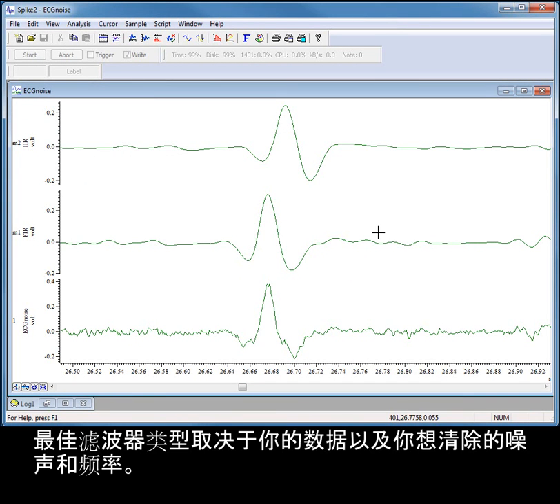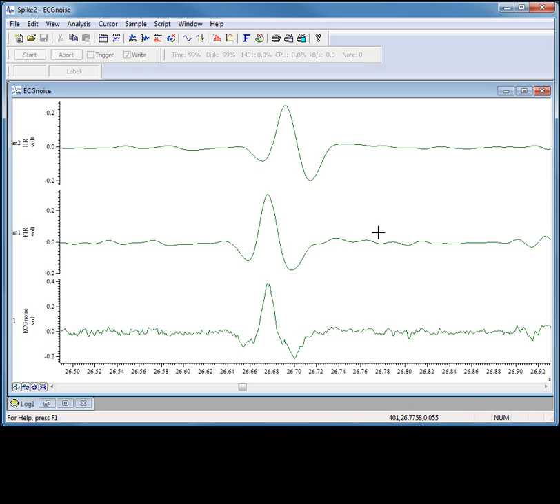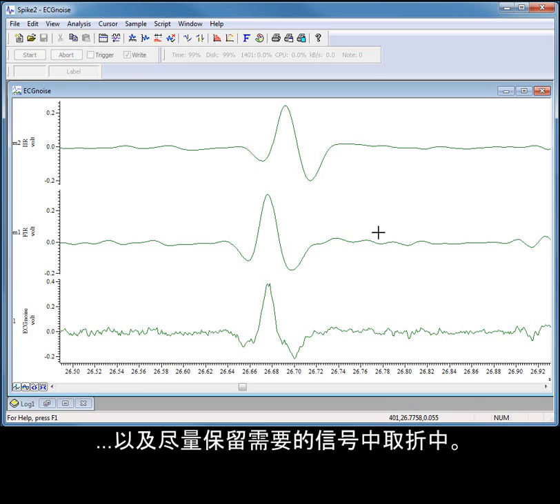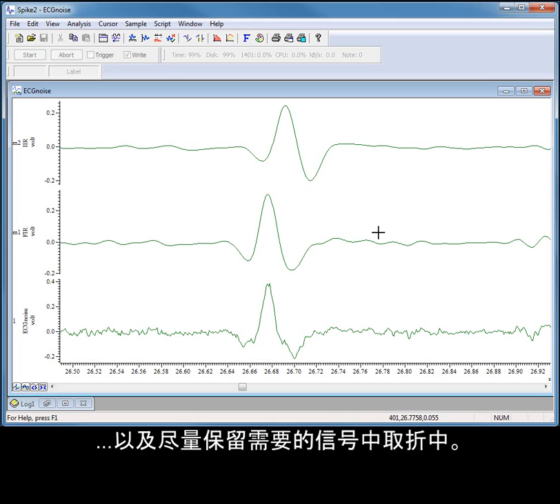The best type of filter to use depends on your data and the noise or frequencies you are trying to remove. When filtering data, it is always a matter of finding the best compromise between removing the unwanted frequencies while preserving as much of the signals of interest as possible.